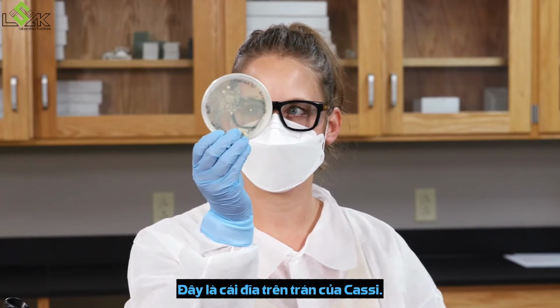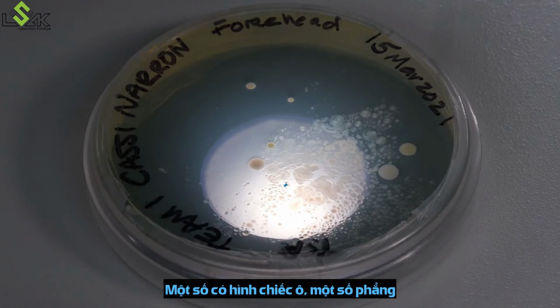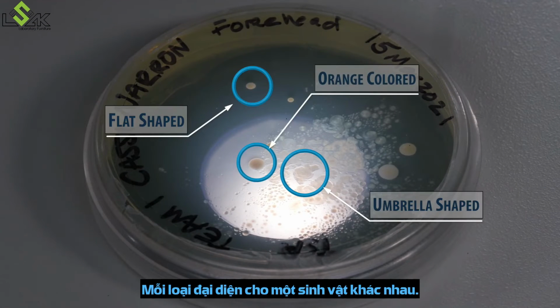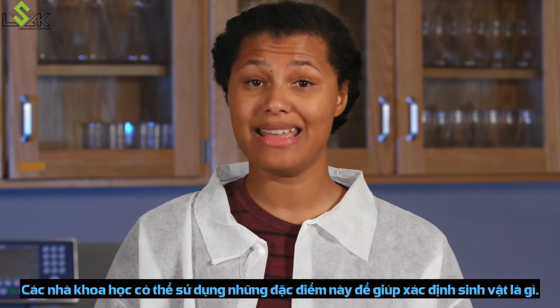Here's the plate from Cassie's forehead. Take a look at the colonies. There are at least 3 different sizes, shapes, and colors present. Some are umbrella-shaped, some are flat, and some are orange in color. Each type represents a different organism. Scientists can use these characteristics to help identify what the organism is.